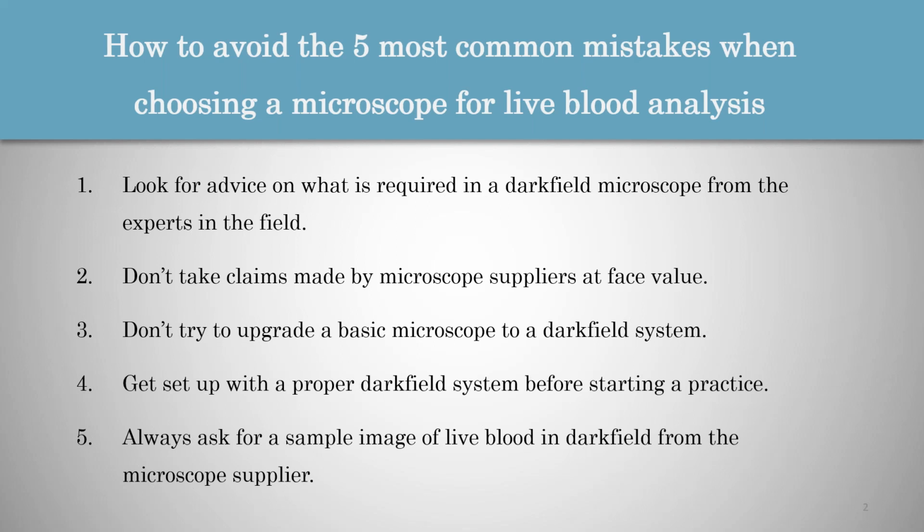So firstly, the first point is to take advice and look for advice on what is required in a dark field microscope from the experts in the field. In other words, if you are looking at getting set up with a microscope for live blood analysis, then look at what the experts in live blood analysis are using and what they recommend.